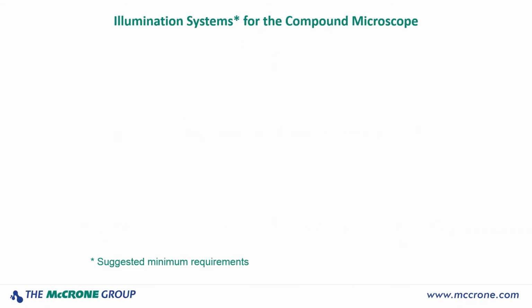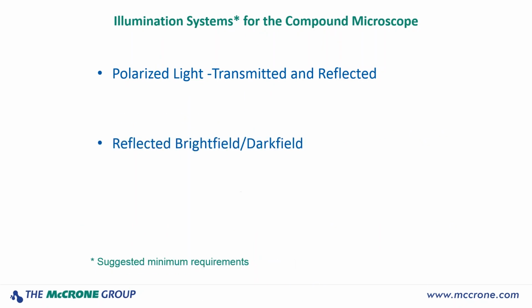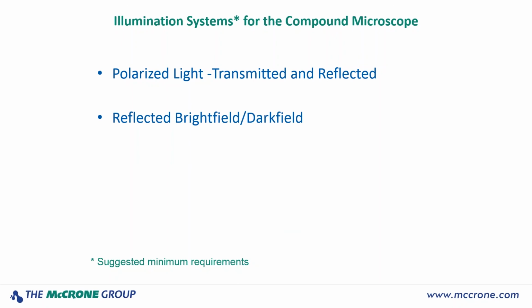So I'll give you some examples now from the compound microscope. And again, I'll show you some of what I consider minimum illumination systems for the compound microscope. Polarized light, very, very important. Transmitted and reflected polarized light.